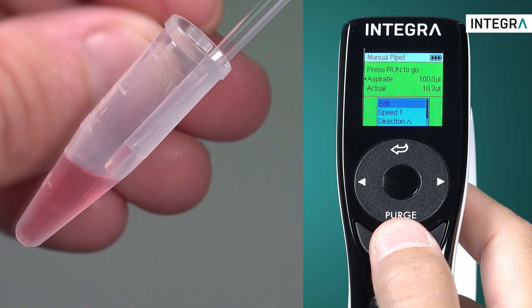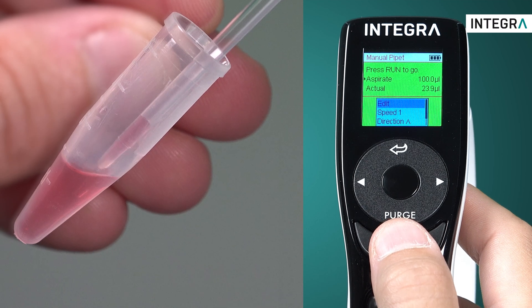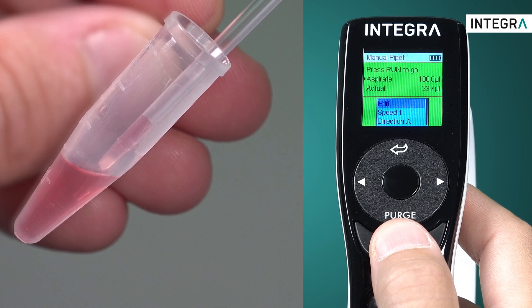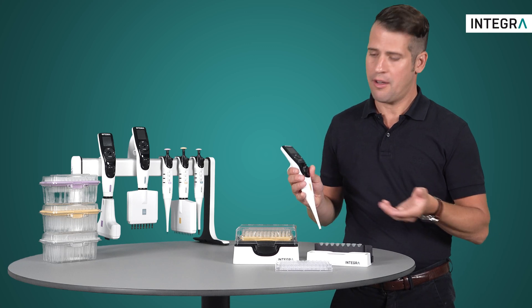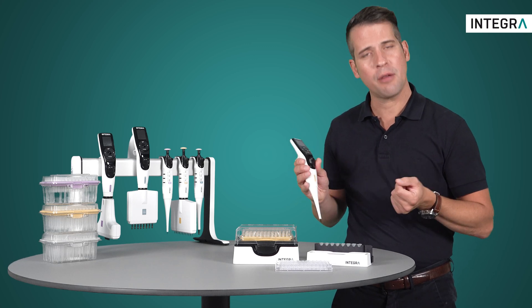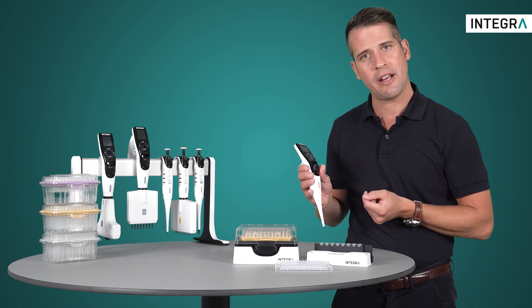By pressing the run button you can control how long the aspiration occurs for, and you can also see on the screen how much has been aspirated or dispensed. To show you what this looks like, we'll be using a ViaFlow single channel electronic pipette with a volume range of 5 to 125 microliters.